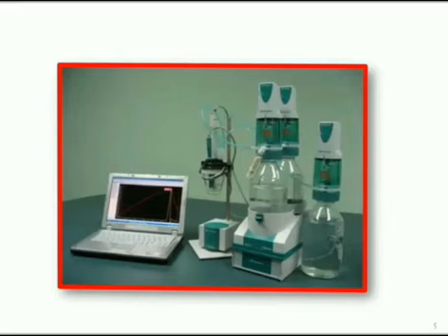The major parts are the motor driven thermostated burette, the Dewar flask, the thermistor bridge, and the recorder, as given in this schematic representation of the thermometric titration instrumentation.